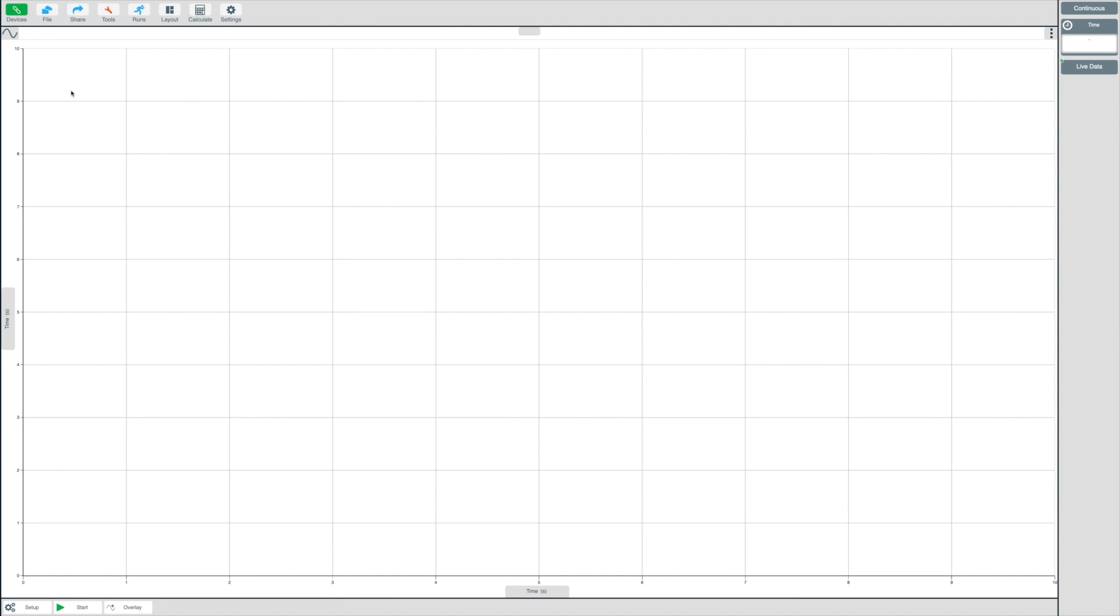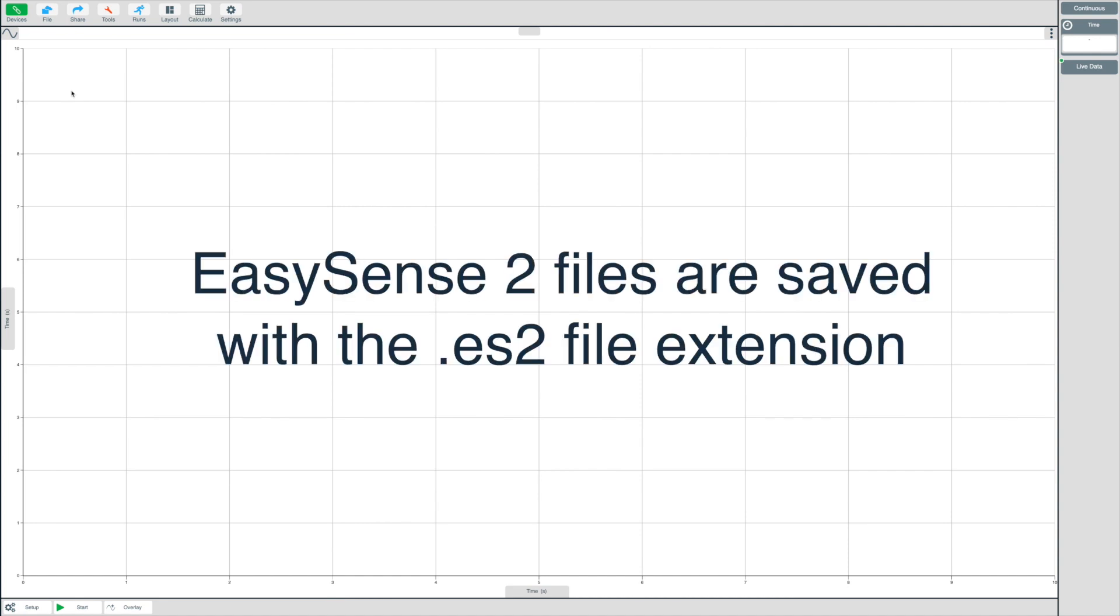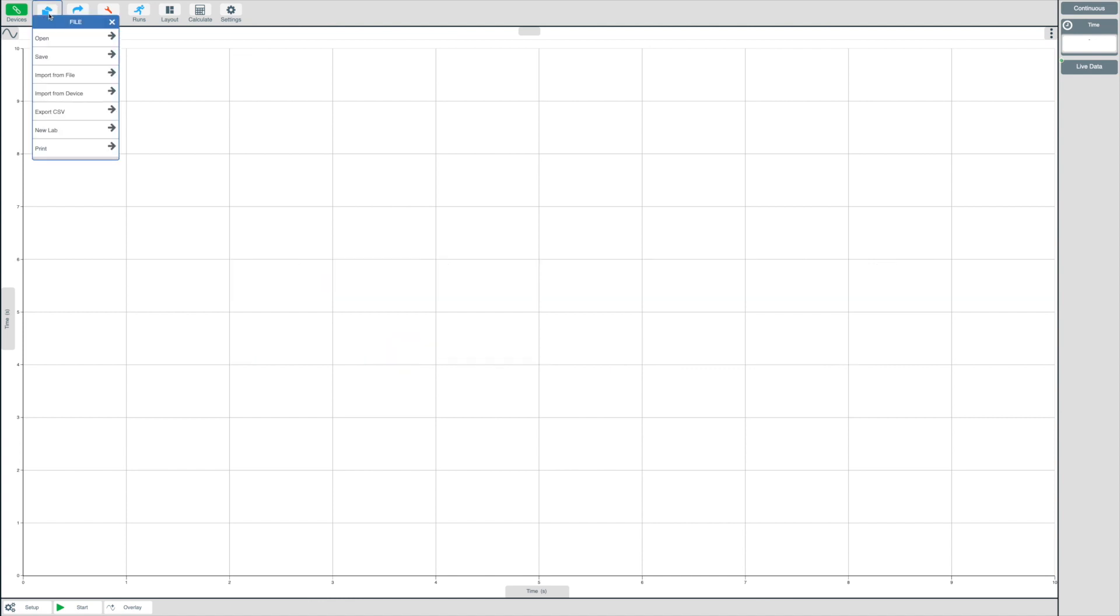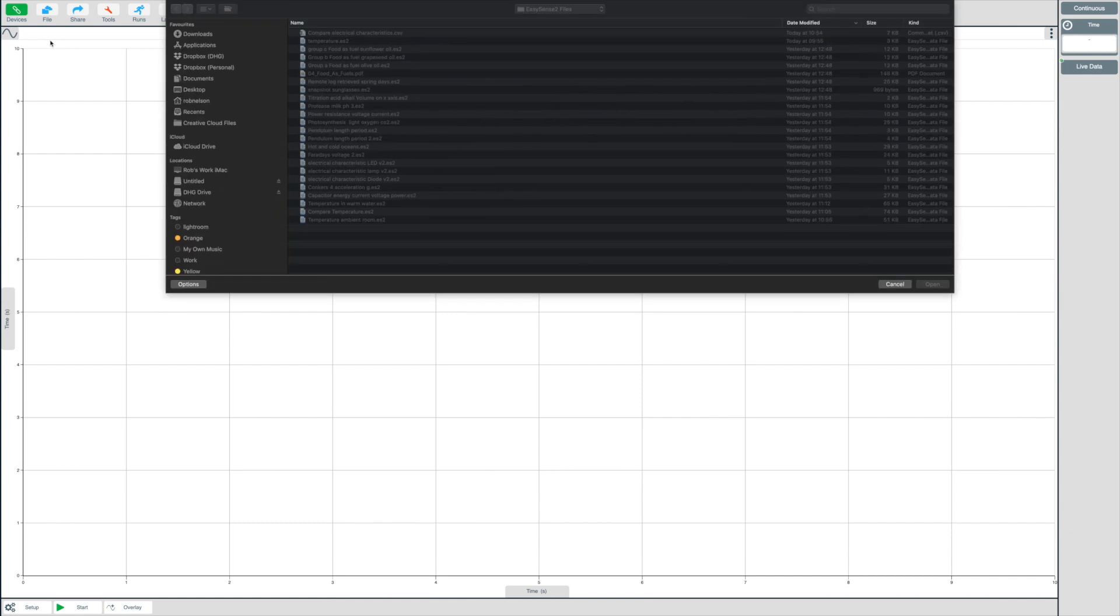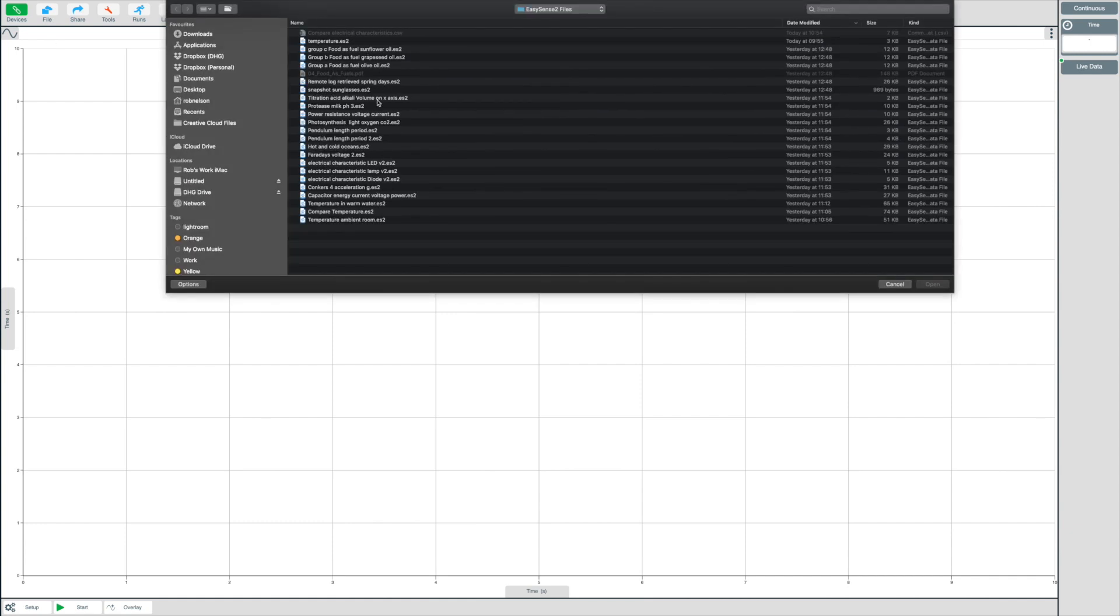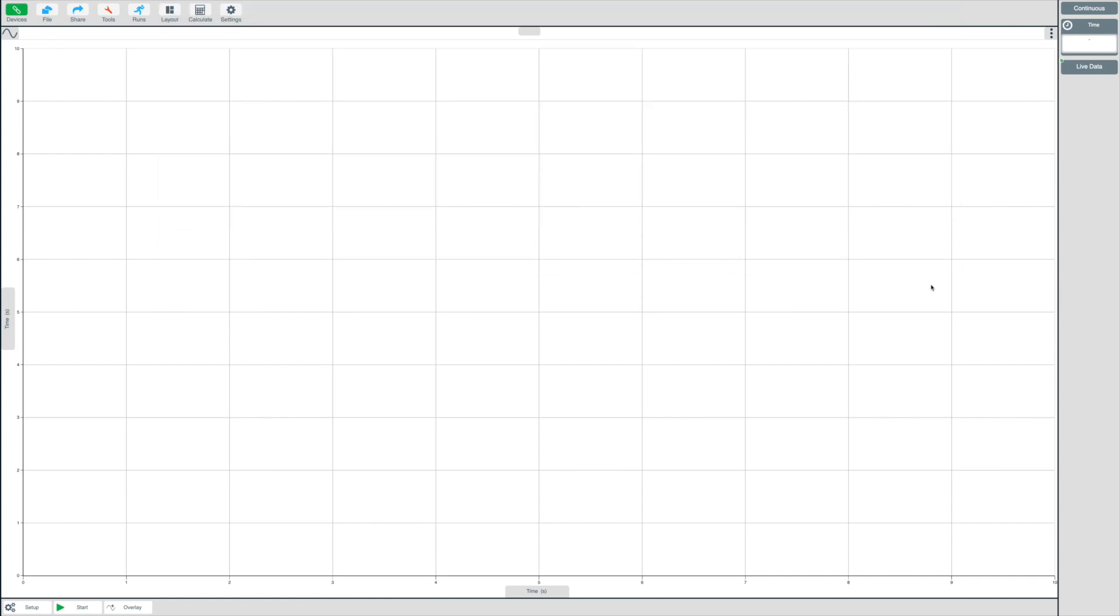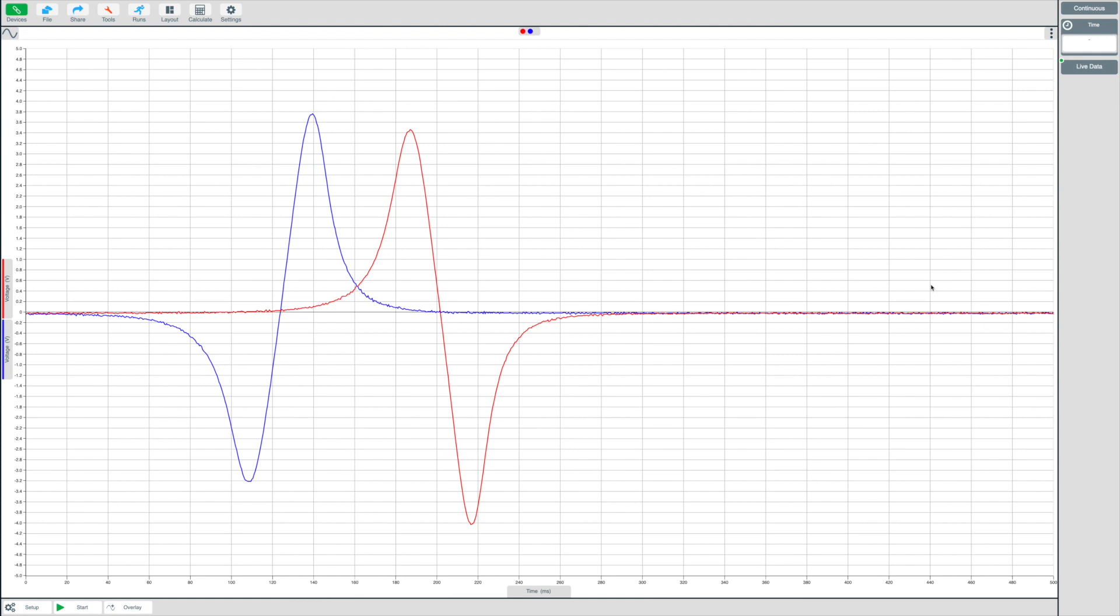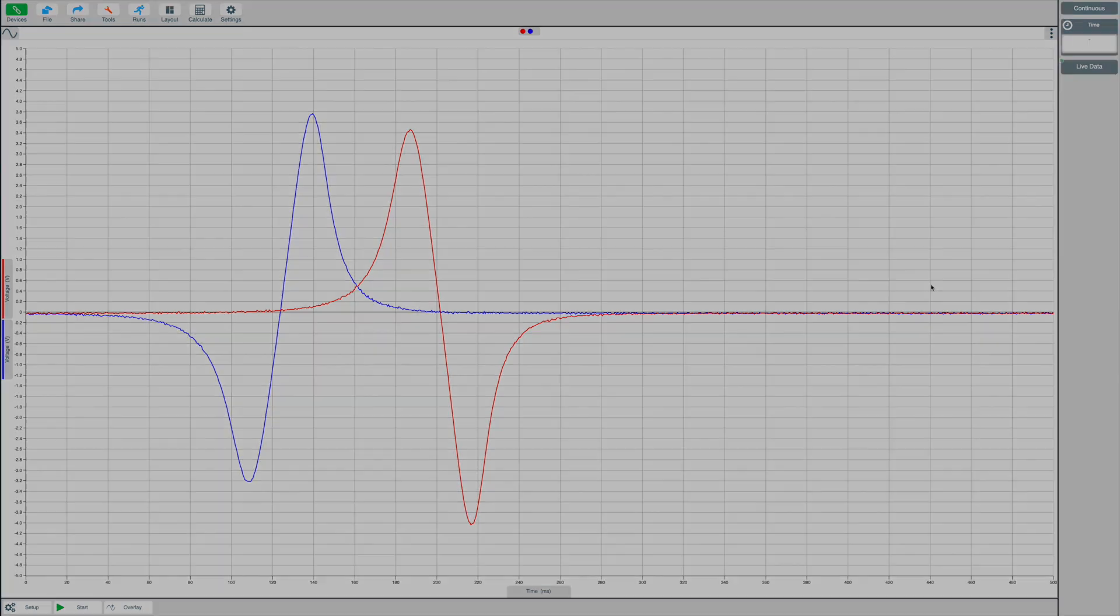First, let's open a previously saved file. EasySense 2 files are saved with the ES2 file extension. Click on the file button and then open. Now select a file from your device and then open. You will now see the data presented as it was saved.